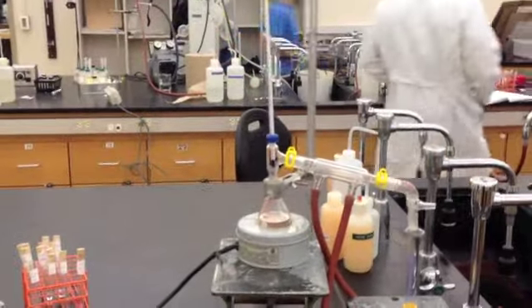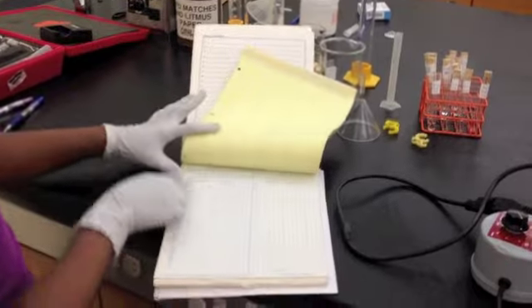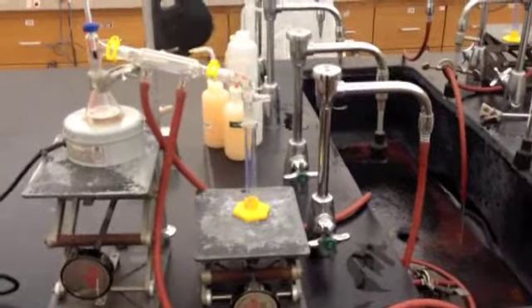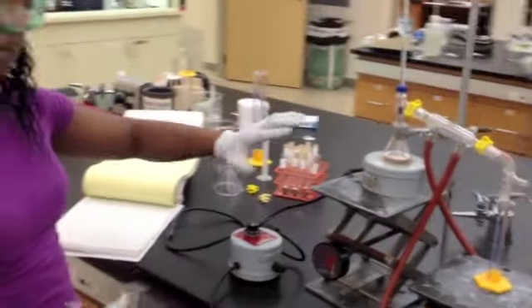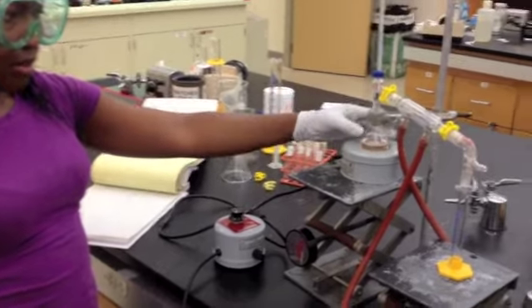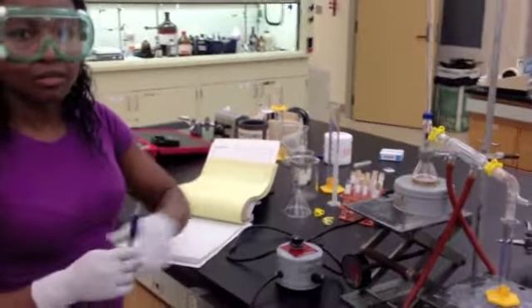Have your table ready in your notebook. Have a table of volume versus temperature, and you're going to record the temperature every 1 milliliter based on volume. So for the first milliliter, I'll record the temperature reading, and I'll keep doing that until I have all my readings and I've evaporated most of the liquid. We'll just wait for the solution to start boiling, and then we'll start recording the readings.